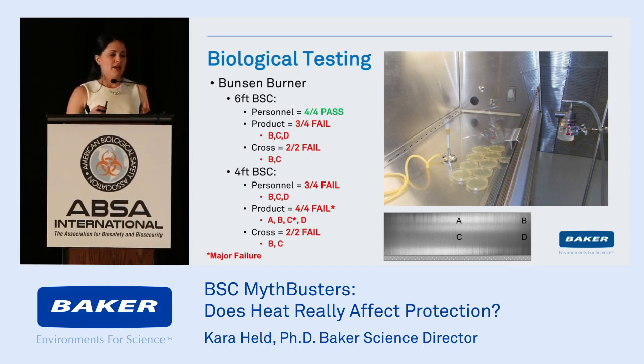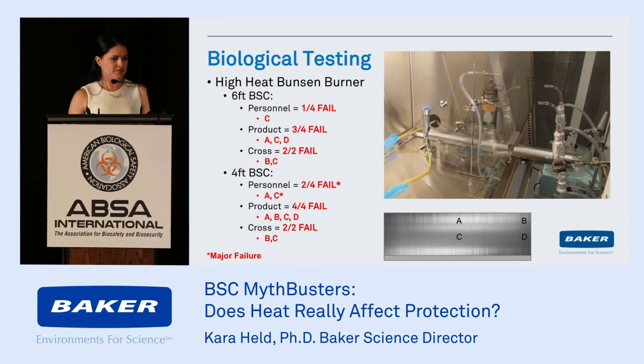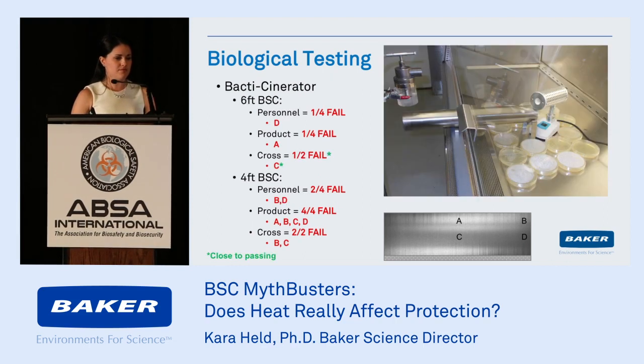So you could see that in the 6-foot cabinet, they actually stood a chance. There were some passings, but when you get down to the 4-foot cabinet, everything is failing. And an asterisk means that it failed especially badly. There was so much bacteria on those plates. The high heat Bunsen burner did worse, as expected. A lot more heat, a lot more disruptions. And again, all 4 locations were affected.